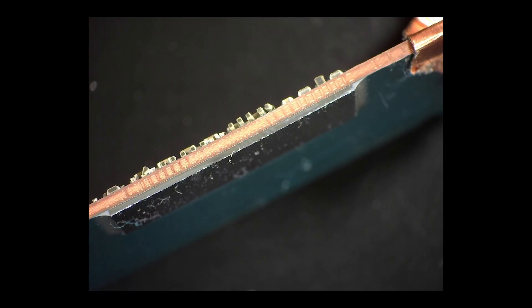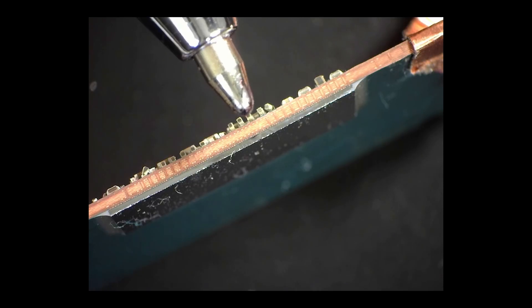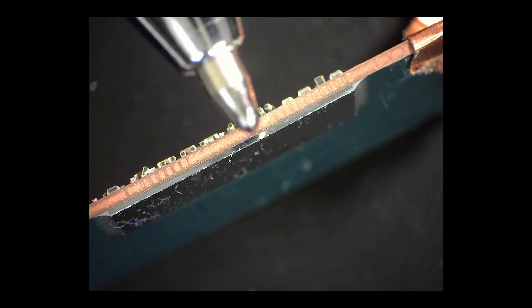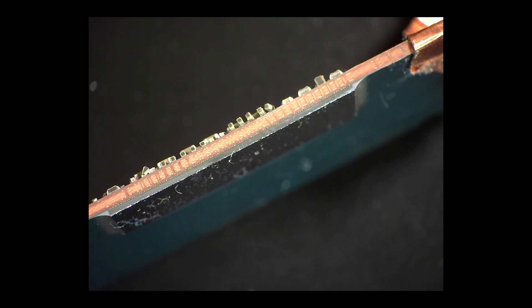Before we go over to the scanning electron microscope pictures, we'll first take a look at the CPU with a normal microscope. You can see the CPU under the normal microscope at a magnification of about 20 times. All those parts on the side are SMD capacitors, in the middle you can see the PCB itself with its layers visible, and on the top you can see the silicon chip. From the CPU itself — all the transistors — we cannot see anything; we would have to zoom in a lot, and that's what we'll do today with the SEM.